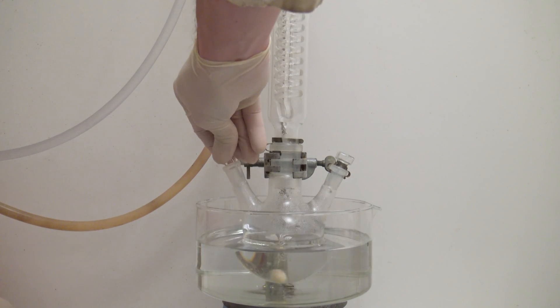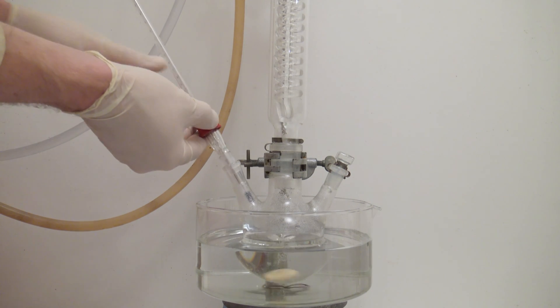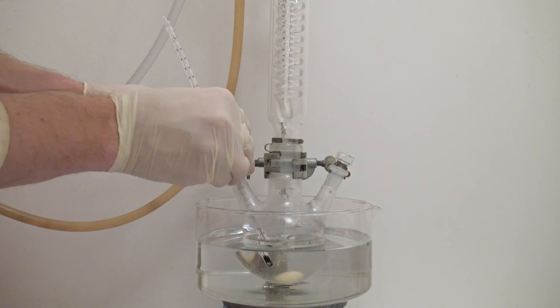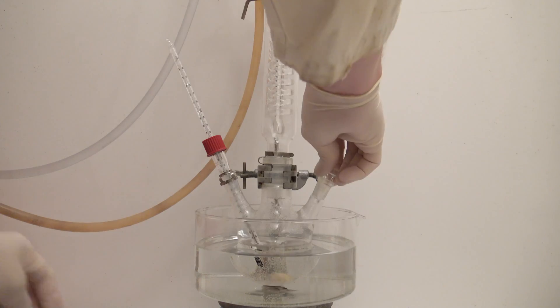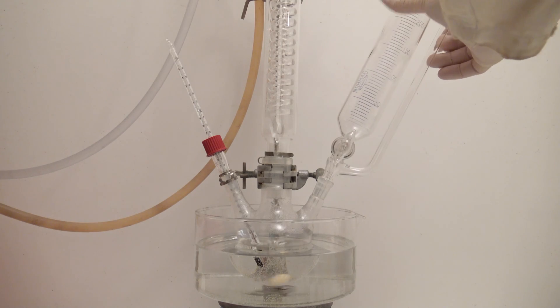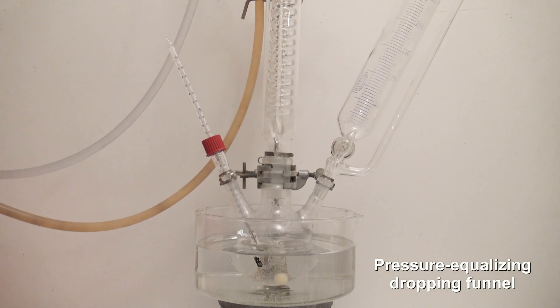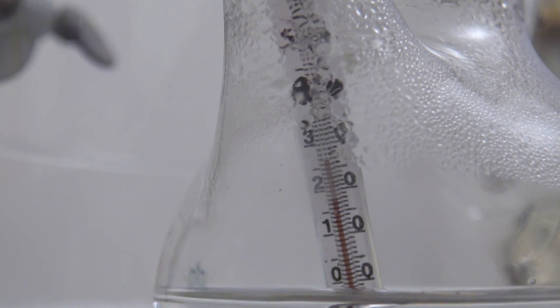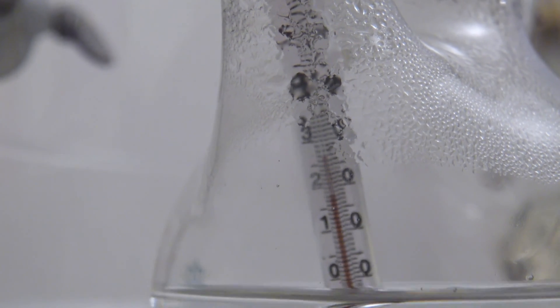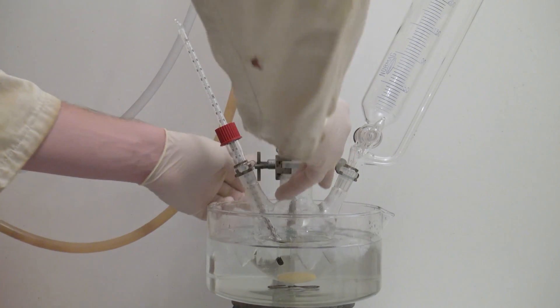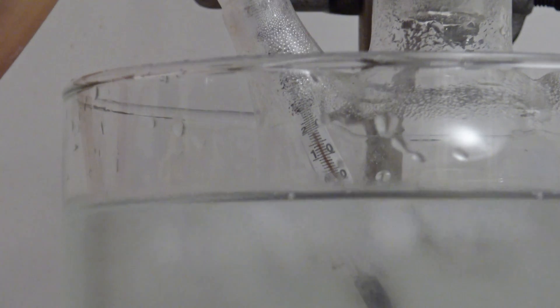For the reaction, a thermometer and a pressure equalizing dropping funnel were added to the flask. The main point in this case is that the hydroxide solution doesn't become too hot and begins to boil. The temperature was already below 30 degrees C, but ice was added to the water bath to lower the temperature even more. It was left until the temperature was at 15 degrees C.